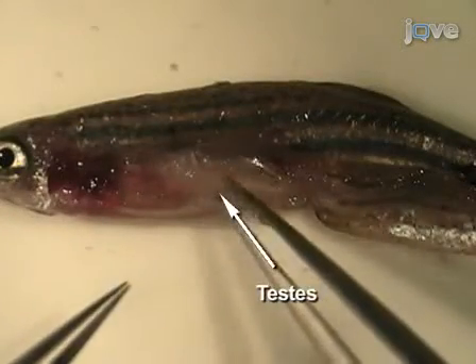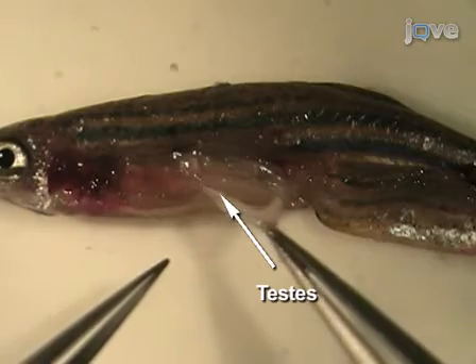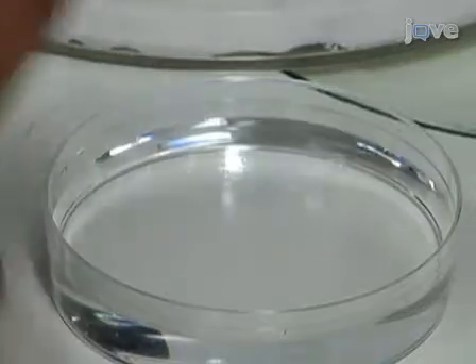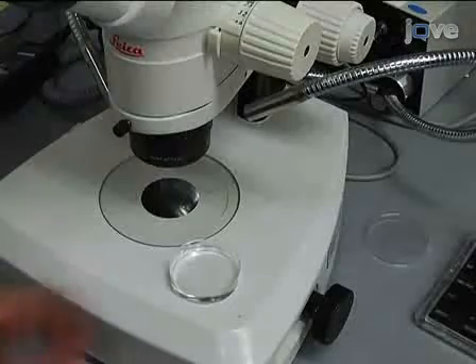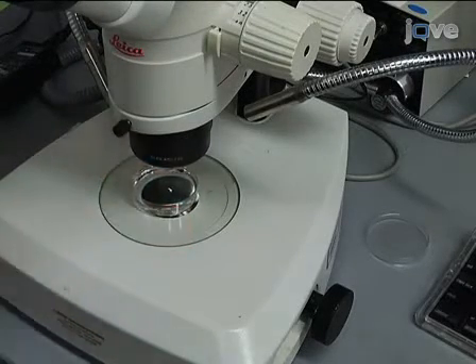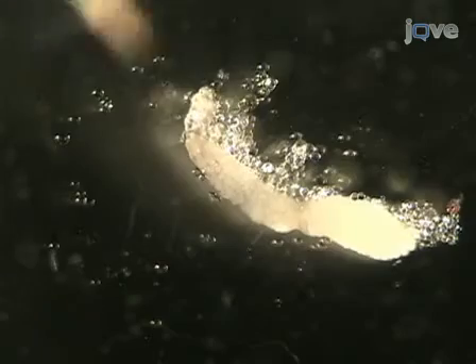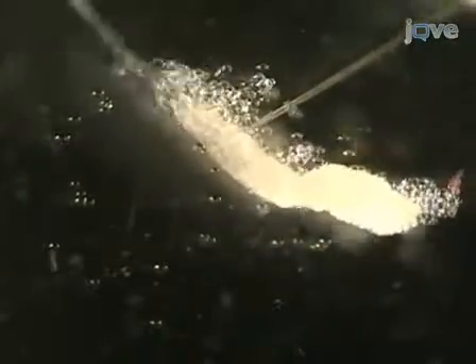The testes are long white paired organs that are attached to the dorsal body wall. Remove the testes and place them in a dish of room temperature PBS. Remove the fat associated with the testes. Examine the testes with reflected light under a dissecting microscope to visualize the seminiferous tubules, which contain cysts with various stages of developing germ cells from spermatogonia to spermatids.